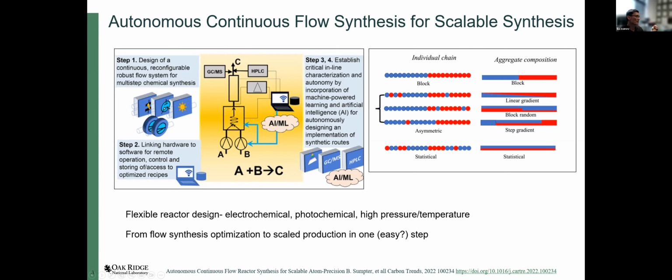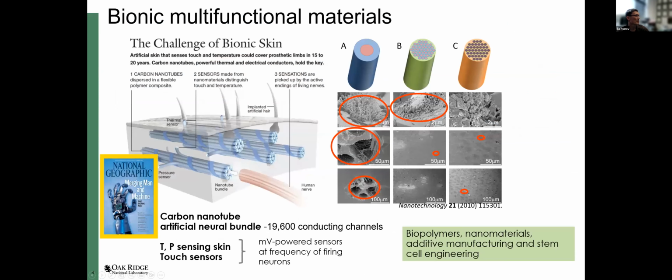One of the biggest advantages of flow synthesis indeed is that you're stepping away from batch processing, and from the lab to the scale of production, everything can be done literally within one scale while increasing the yield of products and efficiency of your production. So this broad range of materials becomes available and will further grow, bringing interesting questions. Where would you use them?